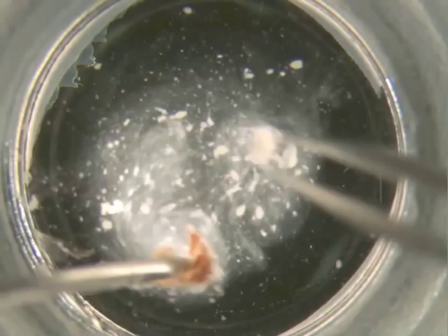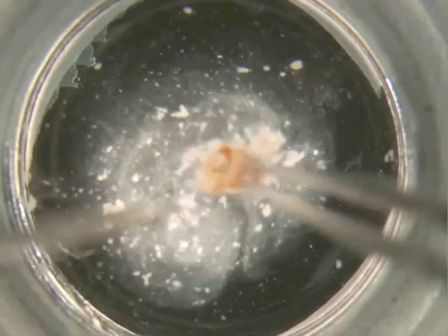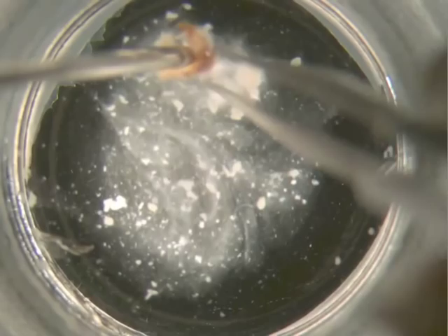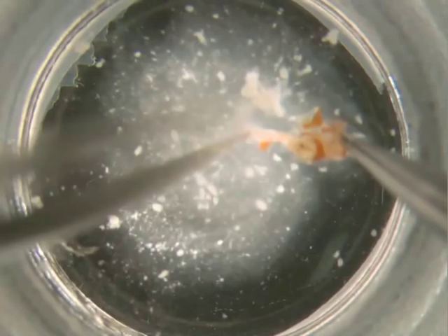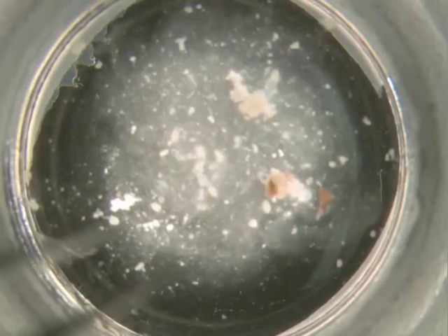Gently tease the tissue away from the shell. Remove all the shell parts.